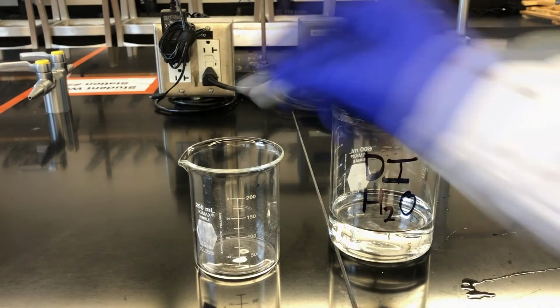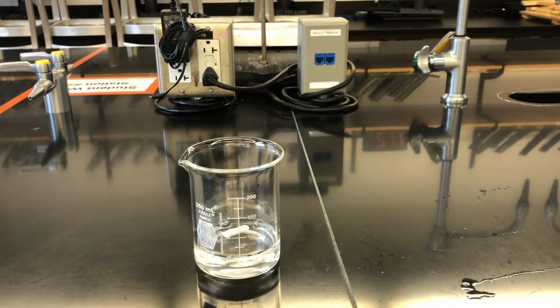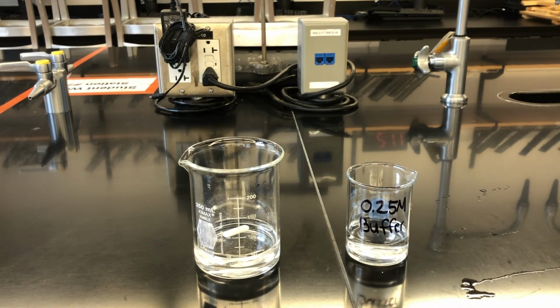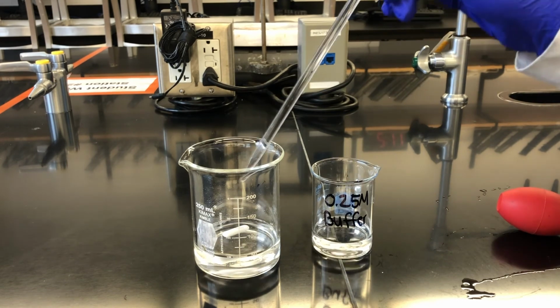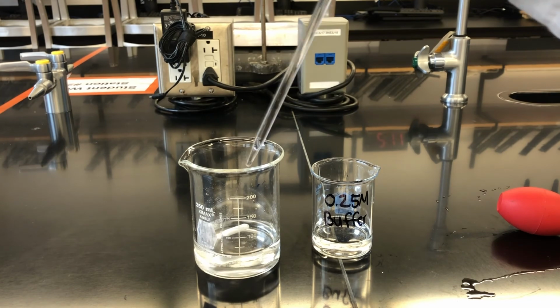Next, we prepare the buffer solution that we're going to titrate into by measuring approximately 50 milliliters of deionized water into a 250 milliliter beaker. Then, we add 10 milliliters of the 0.25 molar buffered acetic acid solution we prepared at the start of Part C, using a 10 milliliter volumetric pipette. Lastly, we add a stir bar, place the beaker on the hot plate, and then set up the burette and pH probe to begin data collection.